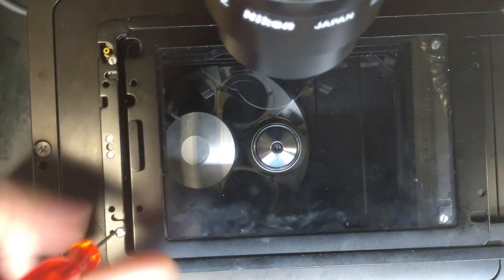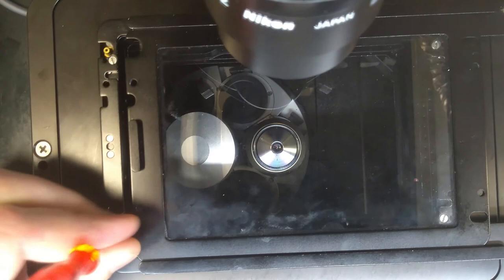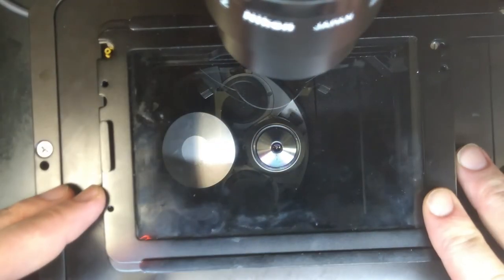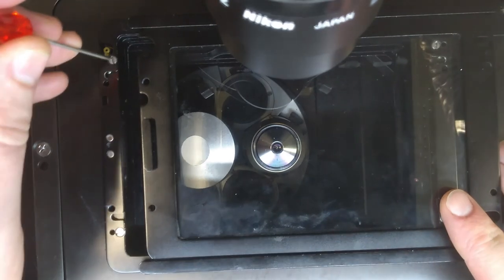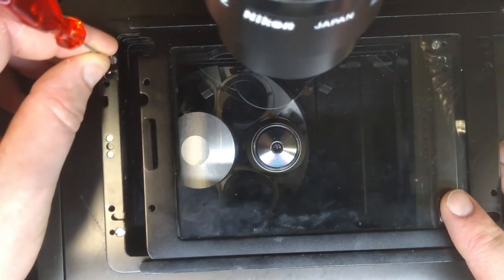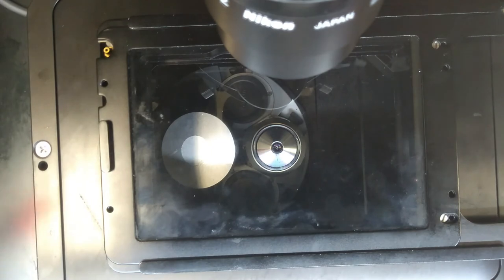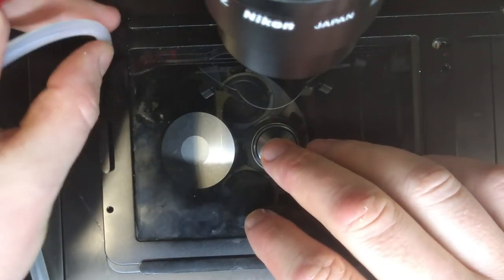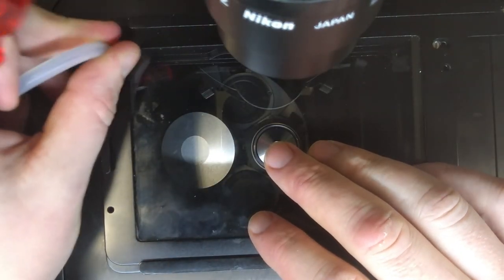You can now tighten this in place. Please don't forget to reattach the gas tube so that the next user who wants to do live imaging actually can have CO2 on their sample.